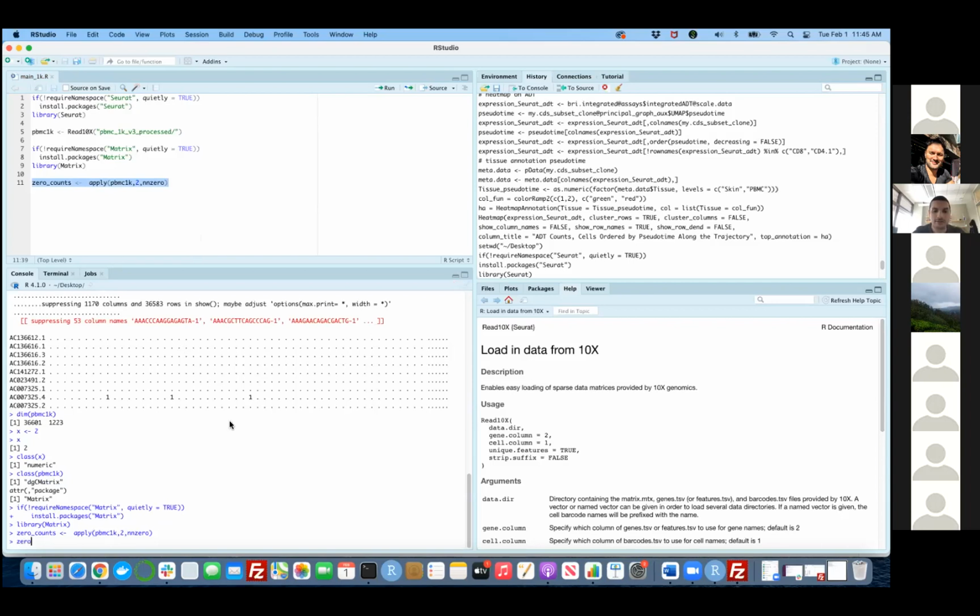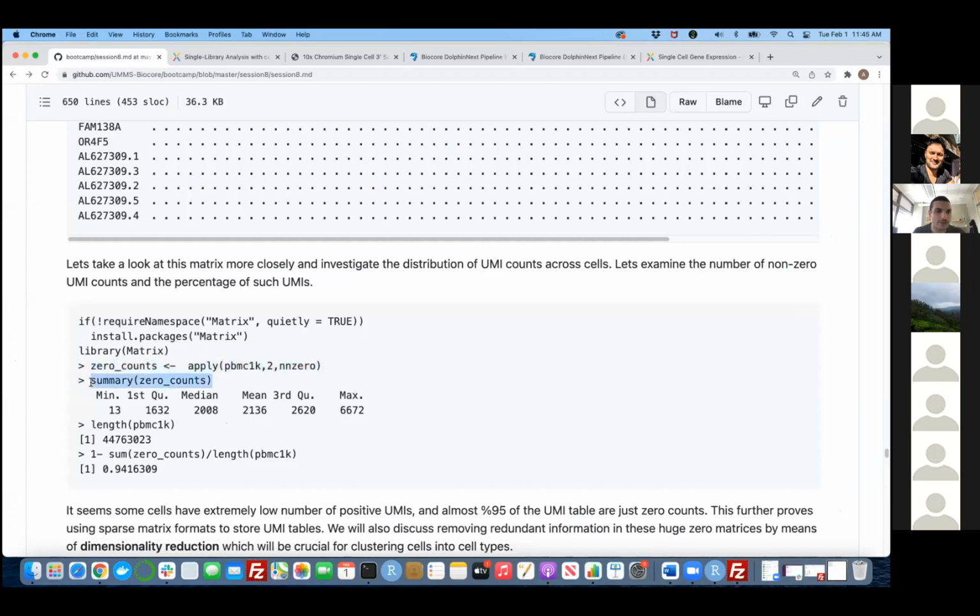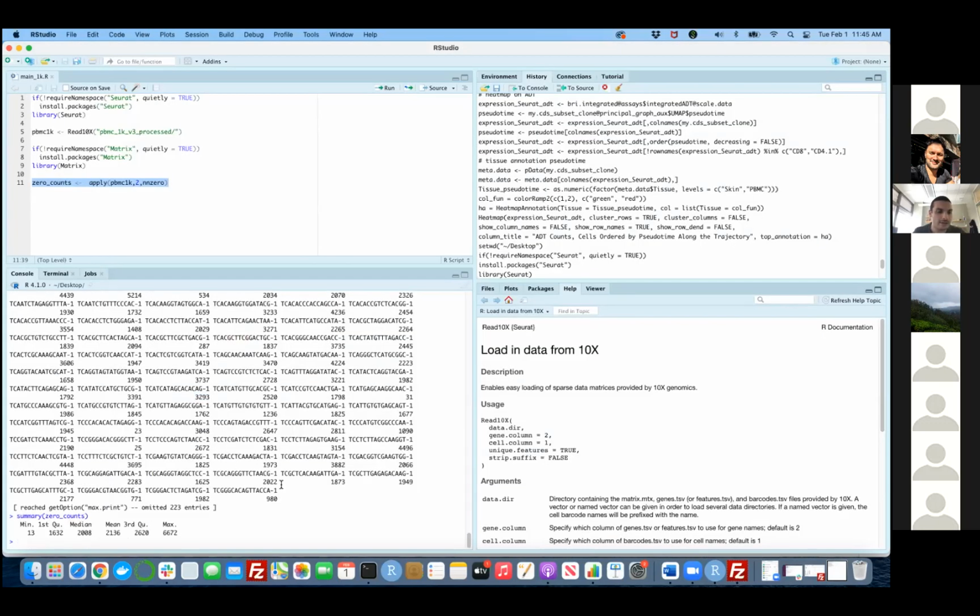it's going to show me the entire list of non-zero counts that each barcode has, right? So basically what this says is that this barcode, which is associated to some cell, has 3,000 non-zero units. So I can actually guess that this is a really good sample because I was able to capture a lot of UMIs in it. So you can quickly summarize these things to see what are the different numbers of total UMIs or non-zero genes that you have in your expression profile.